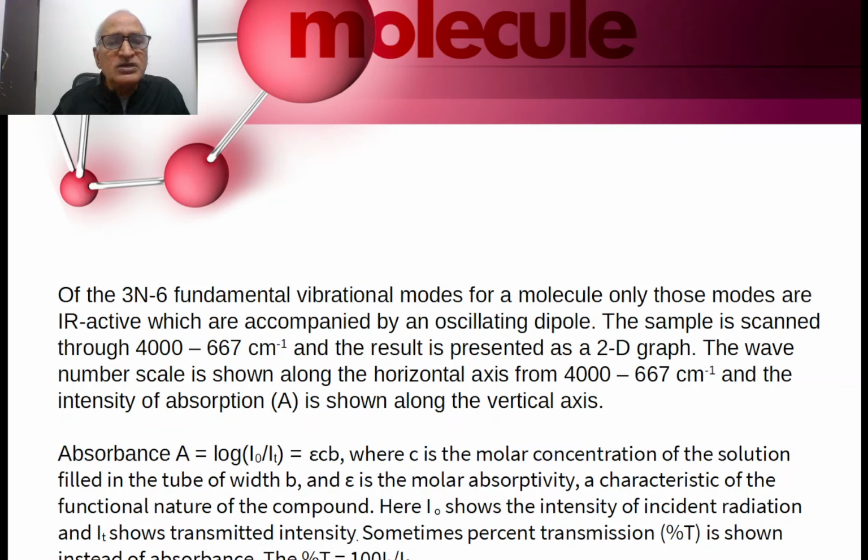Now, what are the conditions for the absorption of infrared radiation? This is to be noted that all vibrational modes of a molecule need not necessarily absorb infrared radiation. Some modes may be infrared active, some may not be active. What are the conditions we are going to discuss now? Only those vibrational modes are infrared active which are accompanied by an oscillating dipole.